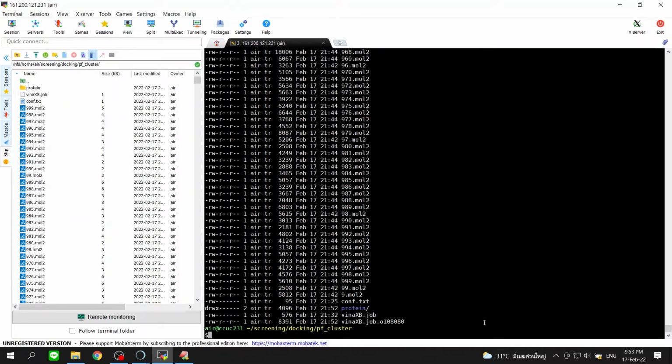Let the program run. And because I have a lot of ligands in the directory, I will show you another output.